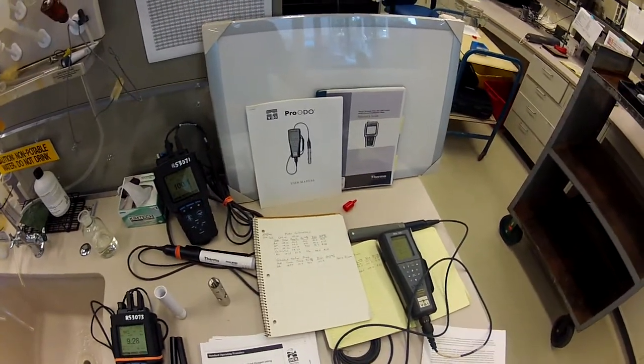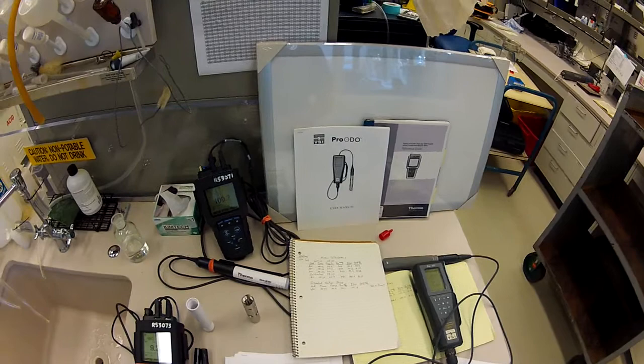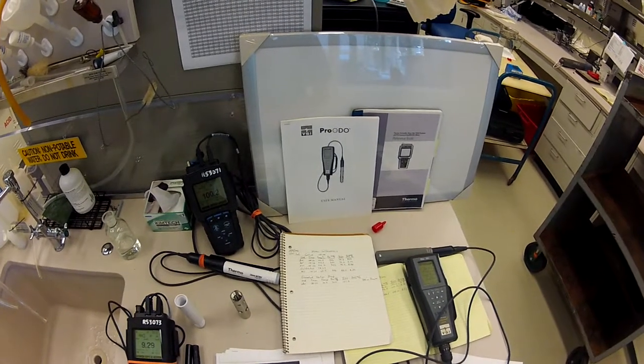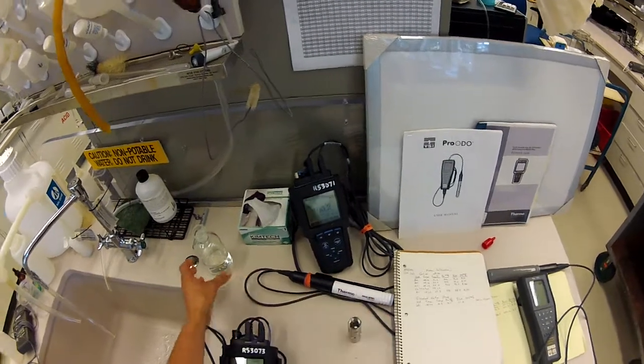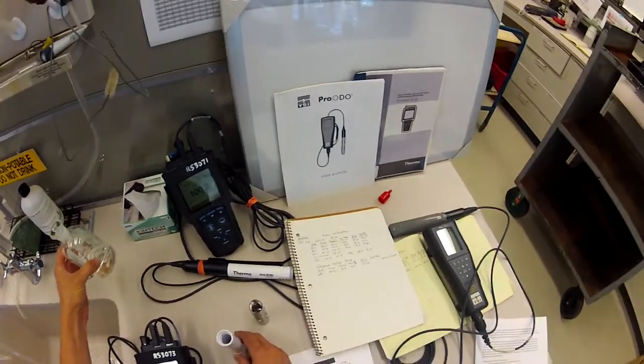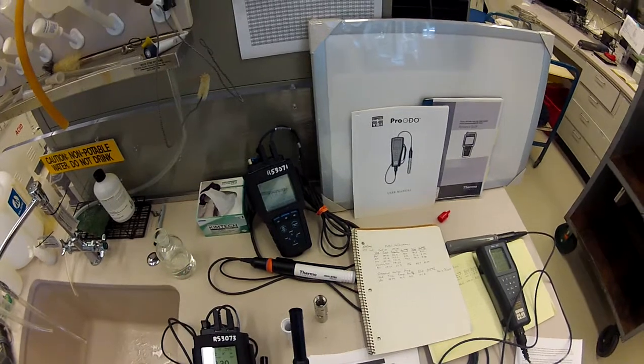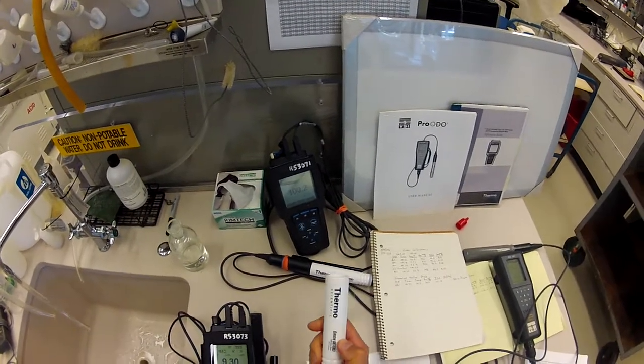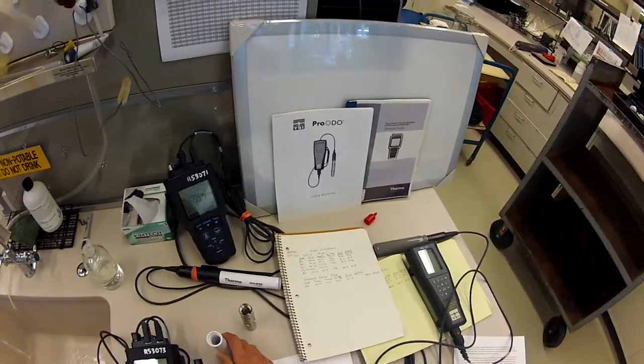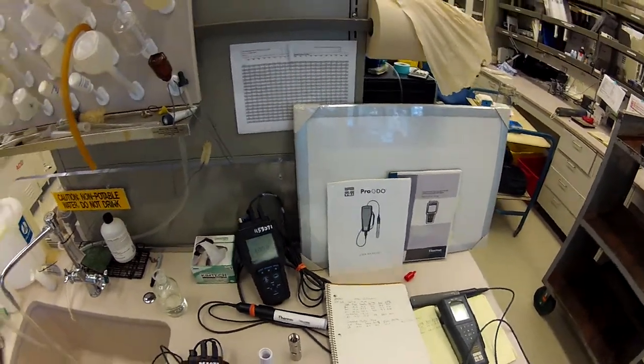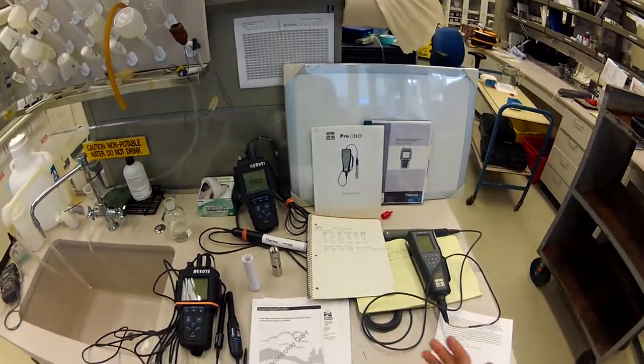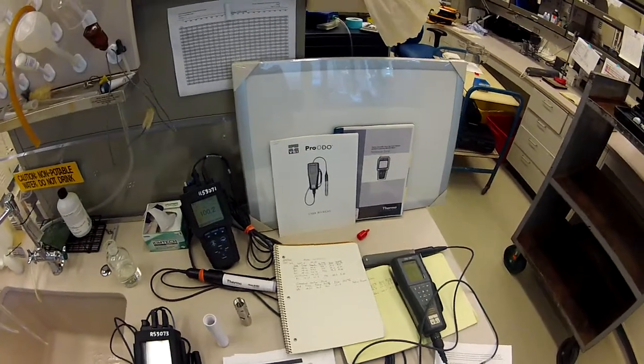So the keys to creating a good standard in your calibration chamber, whether it be something like this or a BOD bottle, are: proper preparation of the probe and the chamber, having a stable environment like we have here in our laboratory or maybe in the office or in a basement, something like that.